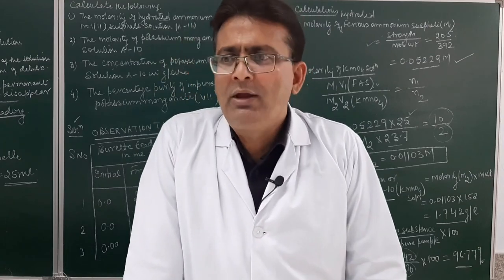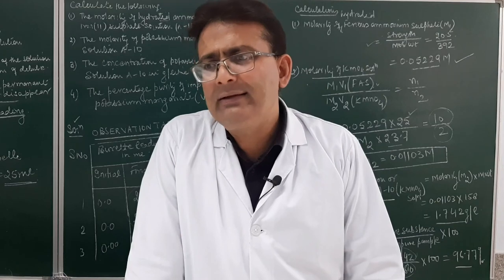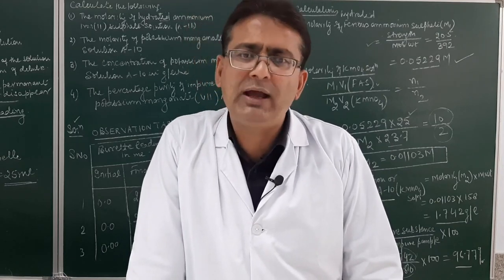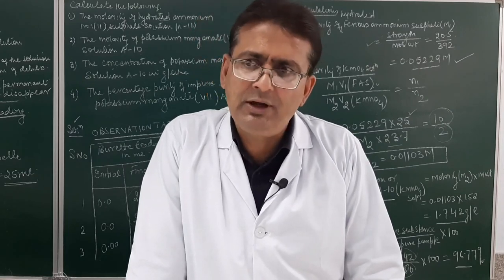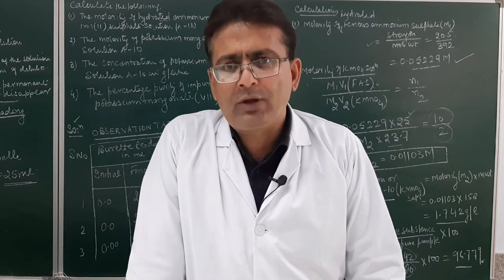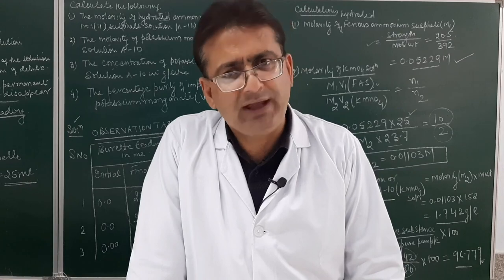I hope this is very clear to you. With this, the first titration in the syllabus has been done with you, in which we have divided this into two parts or two experiments. All of you are expected, whenever you come to the lab, to do it physically and make the practical notebook of that. Thank you.